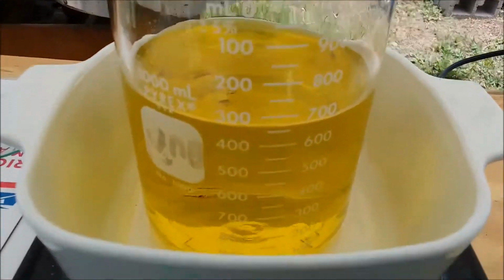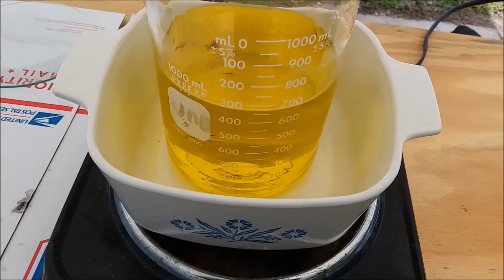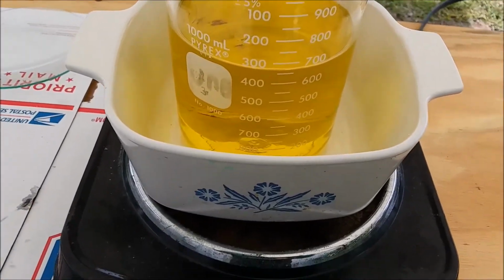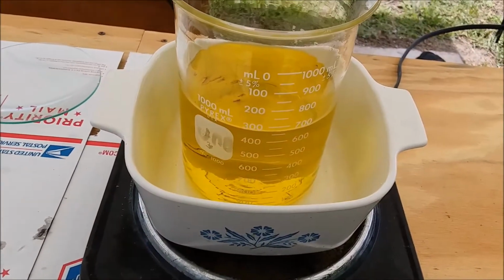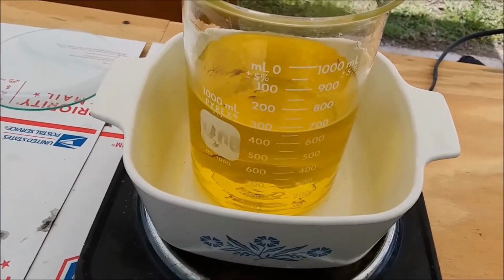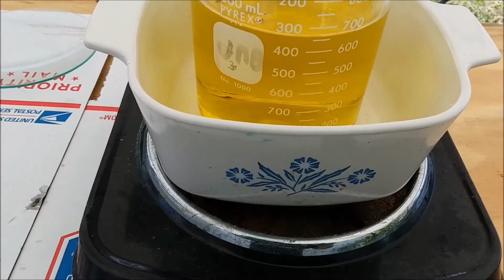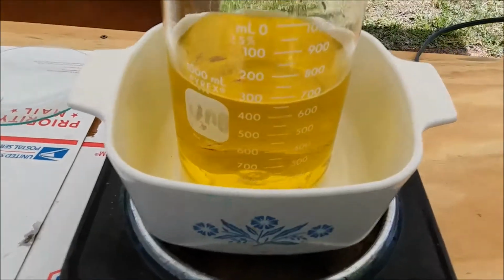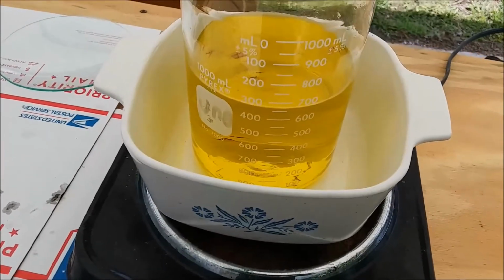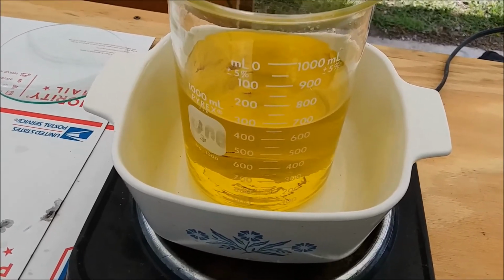Alright, I got my nice super clean and clear liquid all filtered out. I ran distilled water through that funnel and those cotton balls until it was running clear, and combined it all in this beaker. And what I'm going to do now is put it on the heat for a while and maybe heat it up to just below boiling. I want to drive off all the excess chlorine gas that's dissolved in the liquid. I can still smell chlorine. There's chlorine in there. And also, since I filtered this twice, I used a little more rinse water than I planned on, so I've got 650 milliliters of liquid here. I'm gonna concentrate it down a little bit, so it's a little bit more concentrated. So that's gonna take a little while, but you know, hey, I got all day.